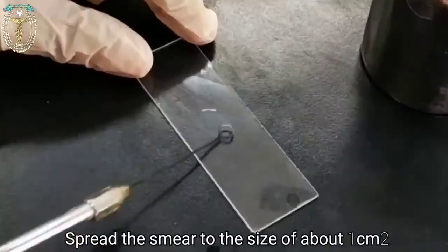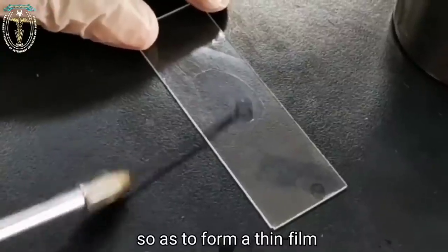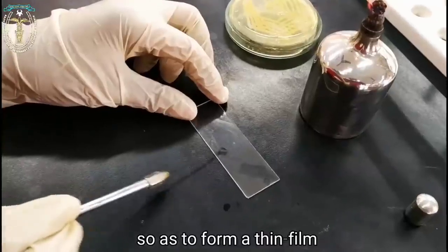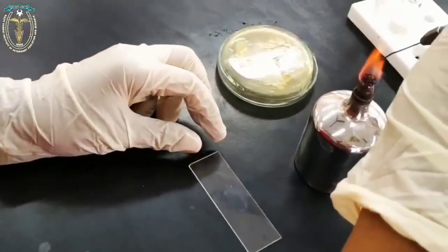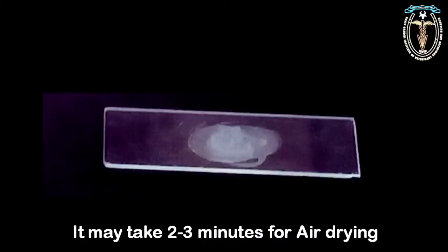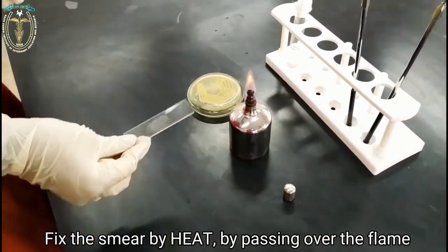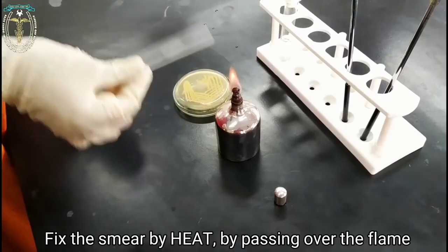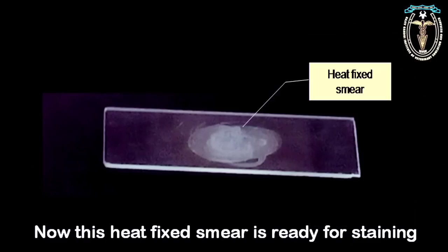After emulsifying, spread the smear to the size of about 1 centimeter square, so as to form a thin film. After spreading, allow it to air dry. It may take 2 to 3 minutes for drying. After air drying, fix the smear by heat by passing it over the flame 2 to 3 times with a slow sweeping motion. This is called heat fixation of the smear. Now, this heat-fixed smear is ready for the staining.